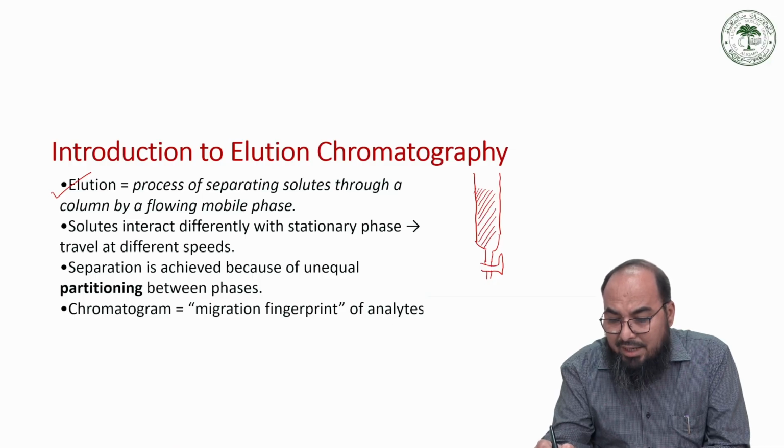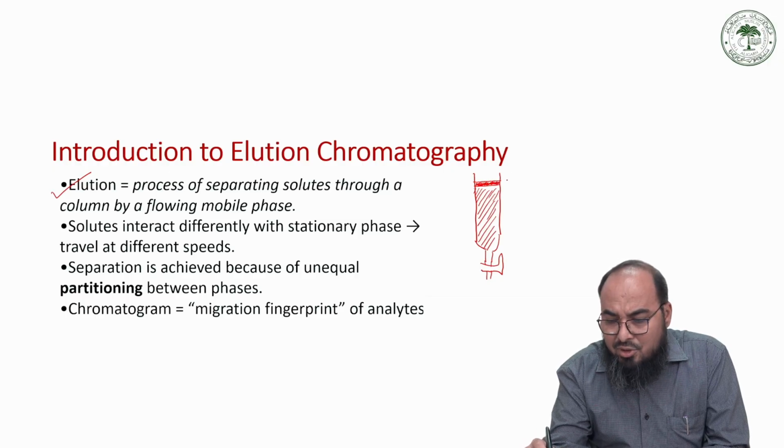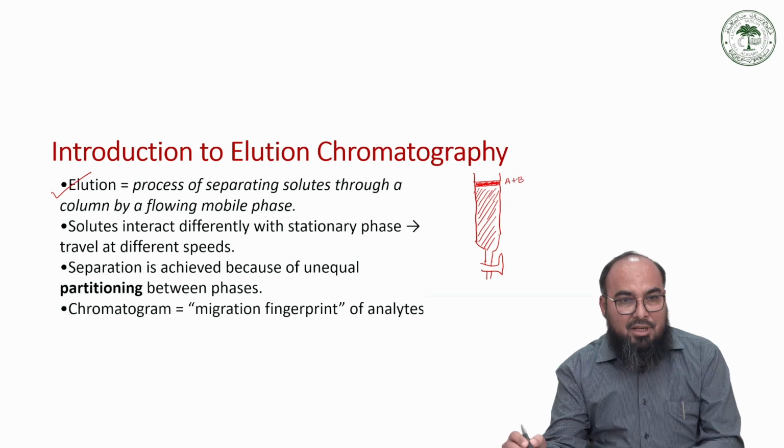Now you have to separate your analyte. Let us suppose that it contains two constituents, A and B.